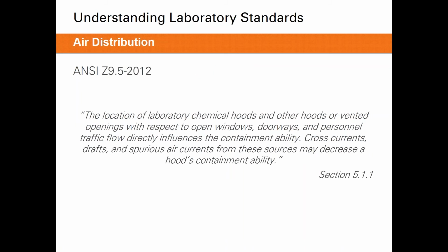If we talk about ANSI Z9.5, the location of laboratory chemical hoods and other vented openings with respect to open windows, doorways, and personnel traffic flow directly influence the containment ability.